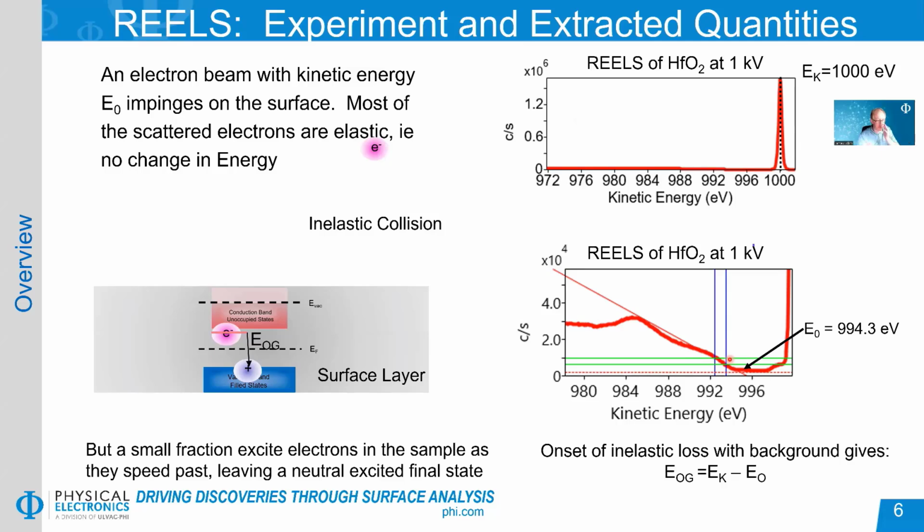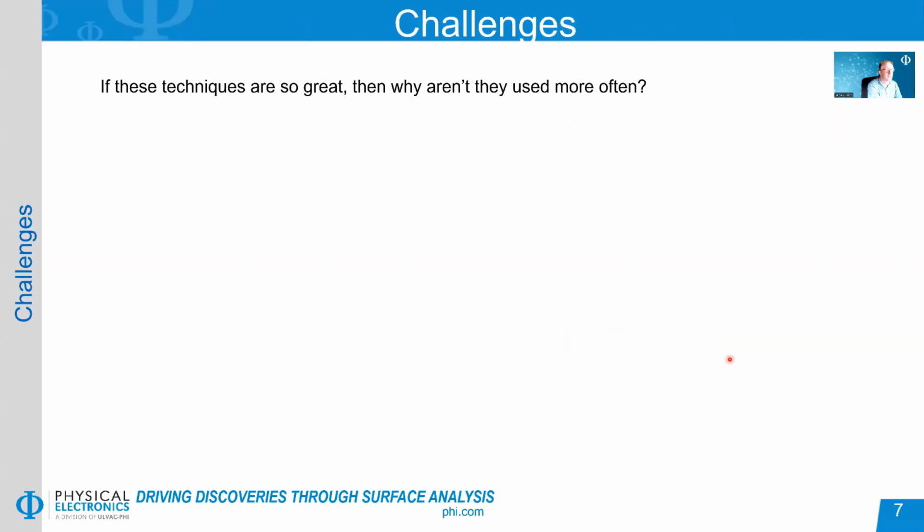Okay, so those are the three techniques. Like I said, if you're not familiar with these, I highly encourage you to go back and watch the first video. But we want to start talking about some practical aspects. Okay, so these are some really powerful techniques, but if they're so great, why don't they get used more often?